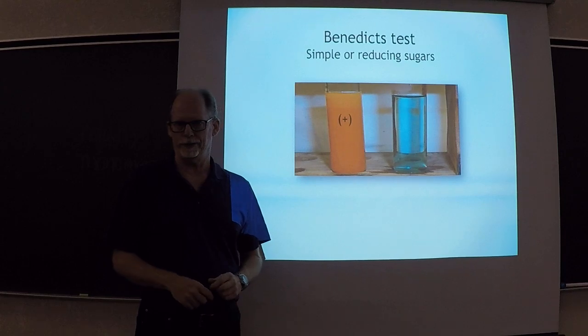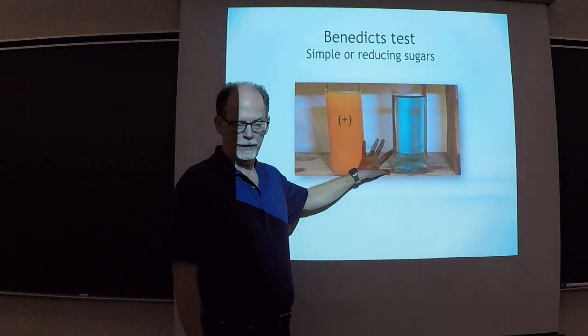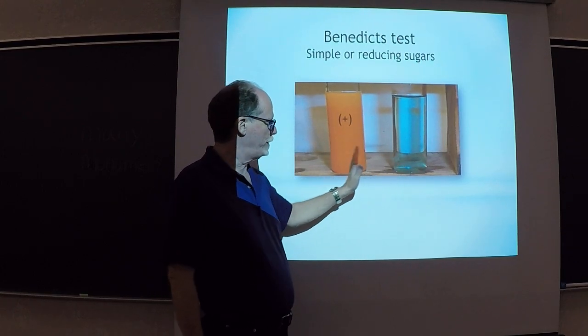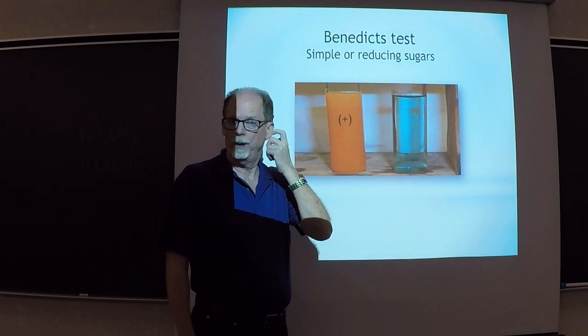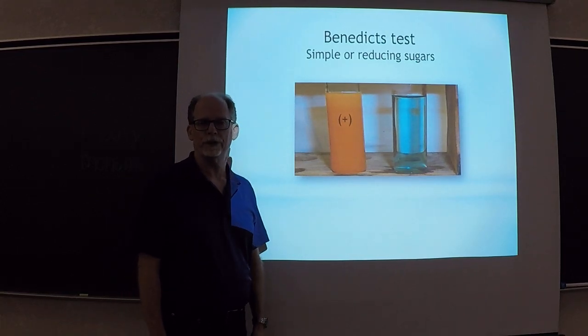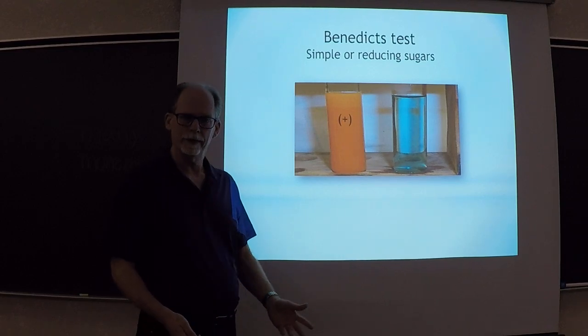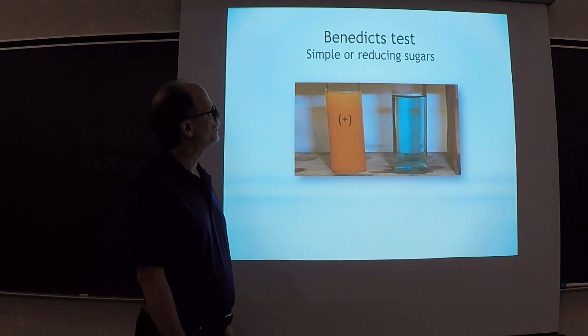So on the practical, you might see this image, and then I'd expect you to tell me which one's positive, what's the name of the test. Those are the kinds of questions. It tests for what? Right, simple sugars, reducing sugars.